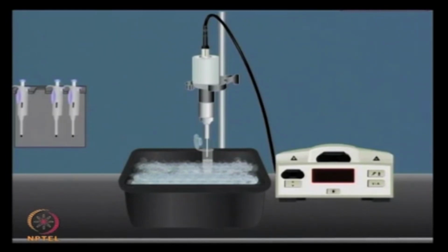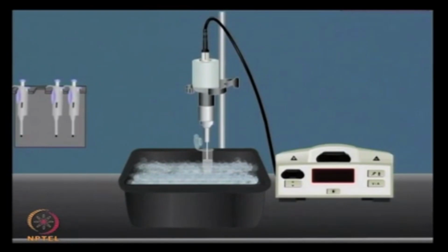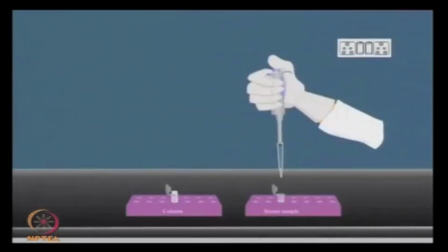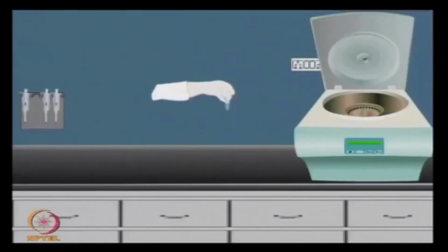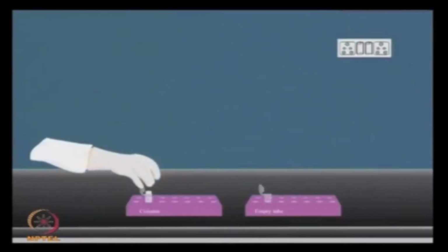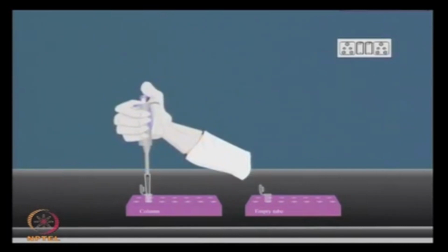So, in this experiment we tried both sonication and depletion of the high abundant proteins. After sonication is done, then we can add the serum sample on the columns. Usually these are commercially available, which can deplete various high abundant proteins. Now, these depletion columns bind only the high abundance proteins onto their matrix through affinity interactions.